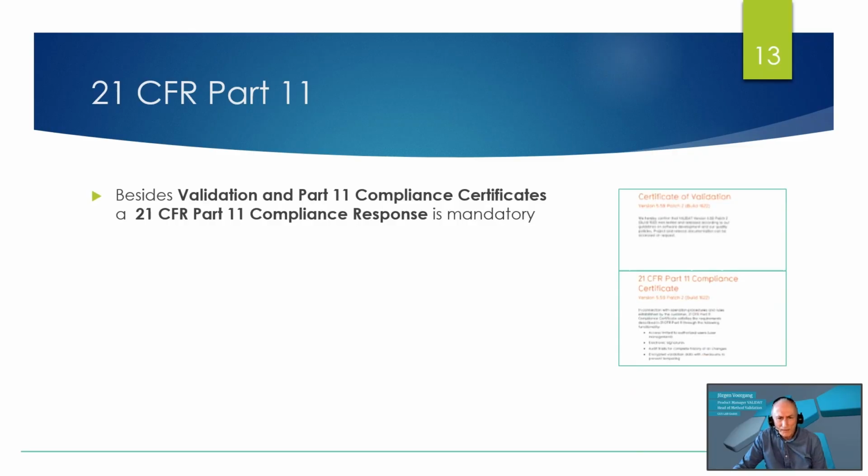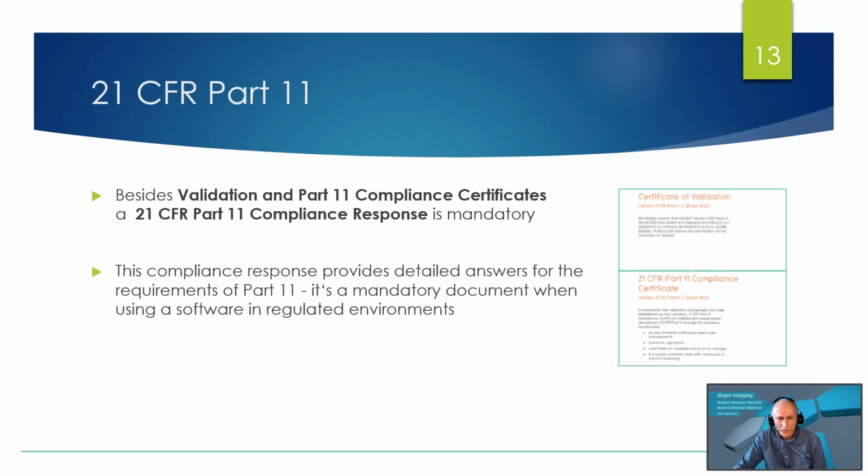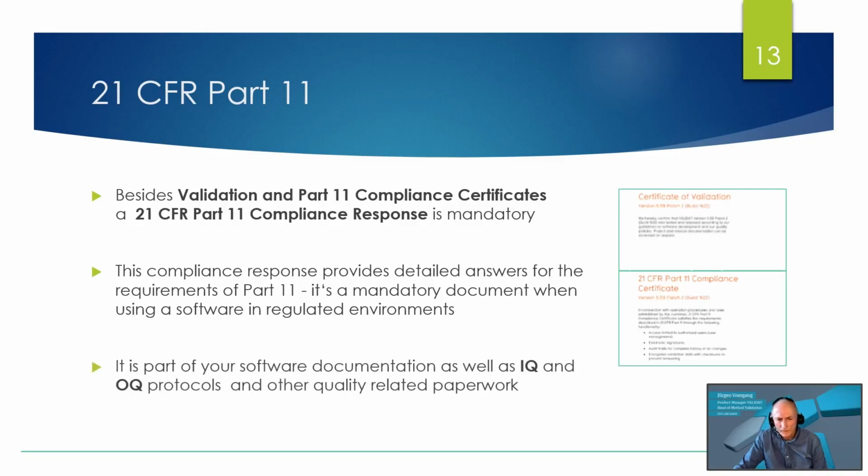Besides validation and Part 11 compliance certificates, a 21 CFR Part 11 compliance response is mandatory. This compliance response provides detailed answers for the requirements of Part 11. It's a mandatory document when using a software in regulated environments. It is part of your software documentation as well as IQ and OQ protocols and other quality-related paperwork.